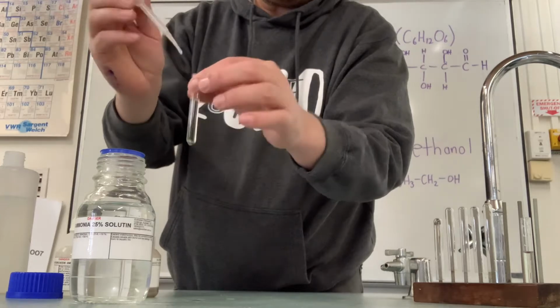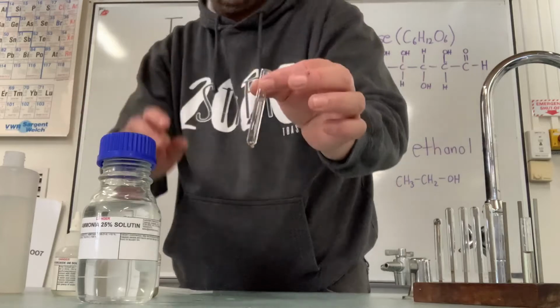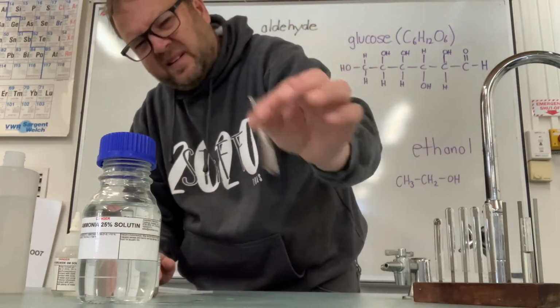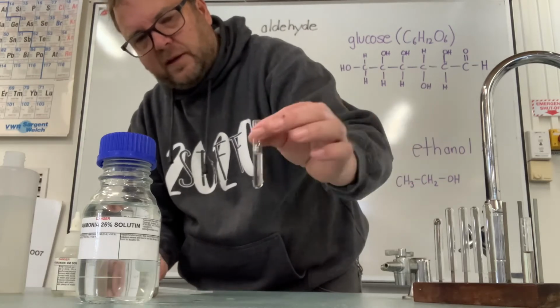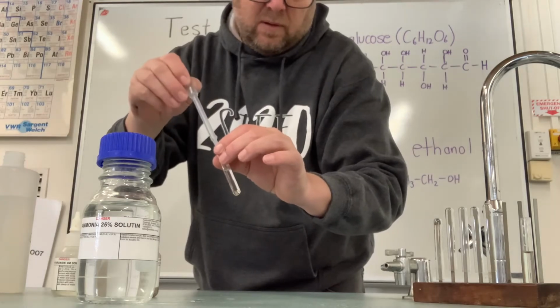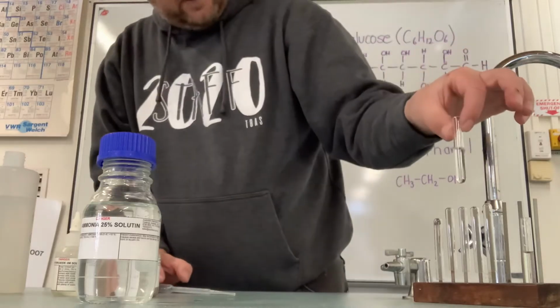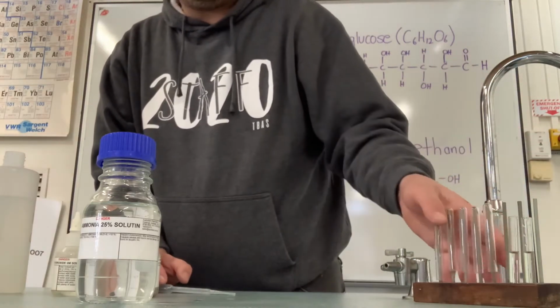Stir that right into the bottom, put that lid on because that doesn't smell real good. Almost there. Use that pipette to blow up. Yep. Now that's all dissolved. So now we have got our 2 test tubes of ammoniacal silver nitrate.